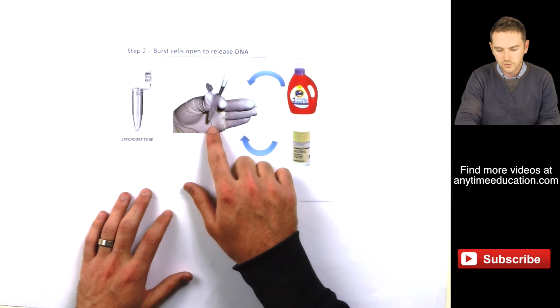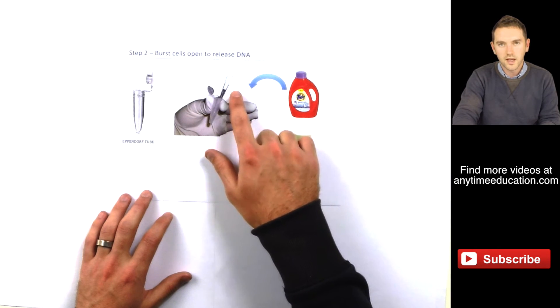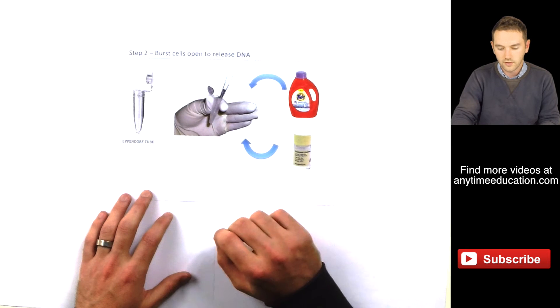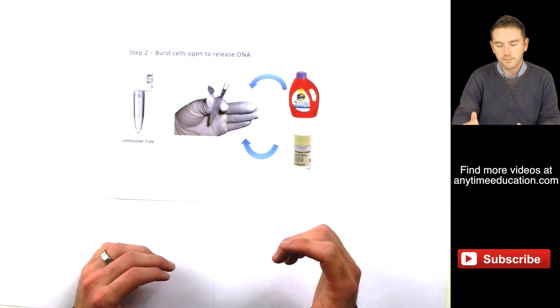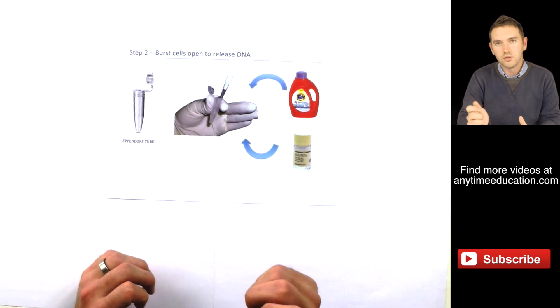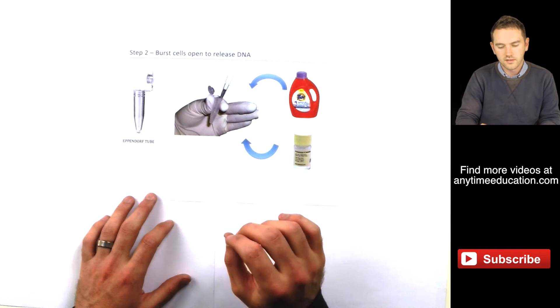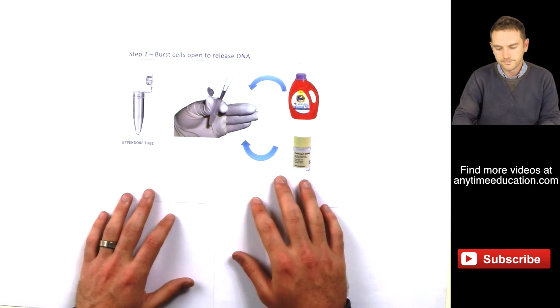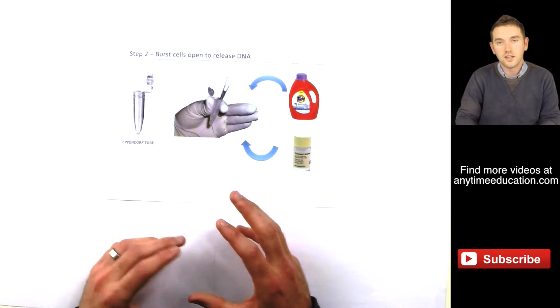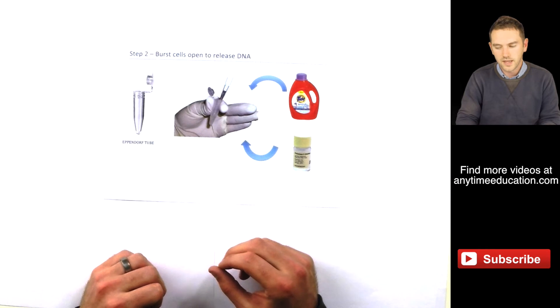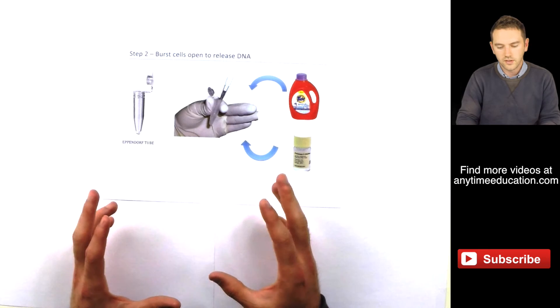You can see the size of our Eppendorf tube based on the picture of that hand. And then we use basically a micropipette to transfer our solutions. That micropipette is like a normal pipette. Except you basically can have real fine control over the volume. So basically what we're trying to do is lyse the cell. So make it burst open. So once we've put all that material in. We give it a bit of a shake. And sometimes we put it in some hot water to speed up that process. And those cells will lyse exposing our DNA material.